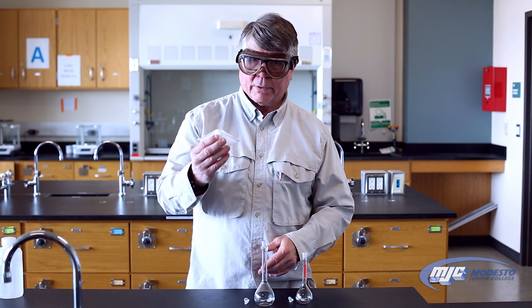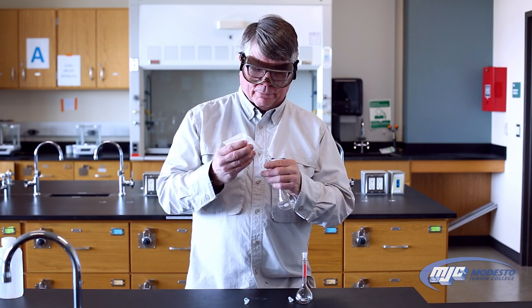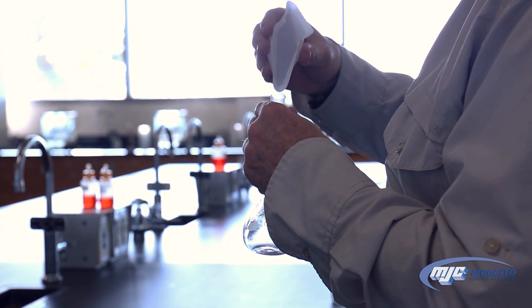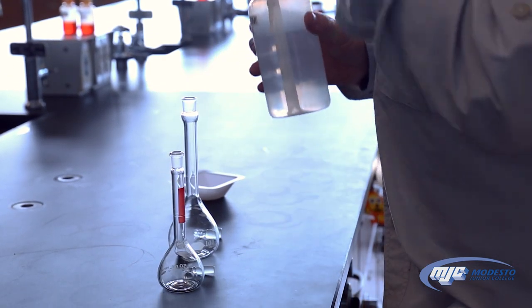I've weighed out a compound here in a weigh boat, so I know how much this weighs — the compound itself. And so I add it into the flask. Make sure I get it all in. And then I add my deionized water to dilute it.